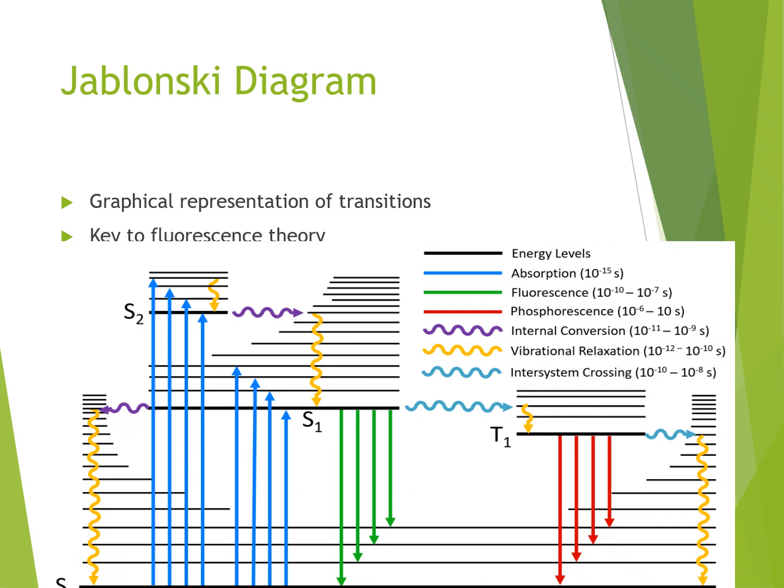And this is absorption of energy, which takes almost 10 raised to minus 15 seconds. And this shows the fluorescence. This is the fluorescence phenomenon. So we will discuss all these phenomena. Before fluorescence emission, we will discuss the internal conversion process, vibrational relaxation and intersystem crossing phenomena.